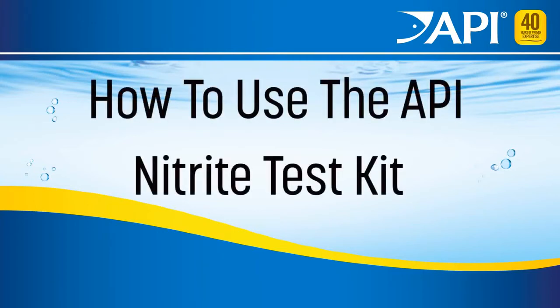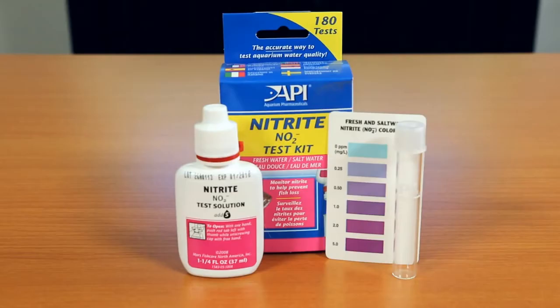How to use the API Nitrite Test Kit. The API Nitrite Test Kit is an easy and accurate way to monitor nitrite in fresh and saltwater aquariums.